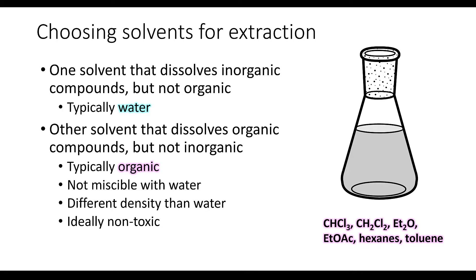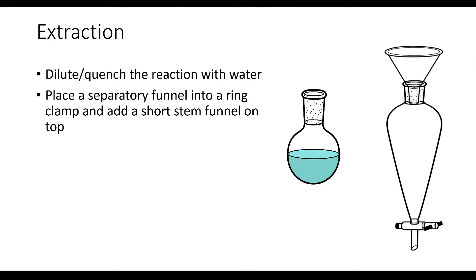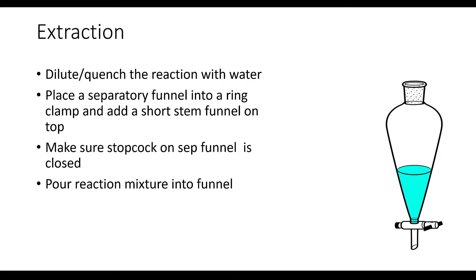Now let's talk about the details of the extraction procedure. We start by quenching or diluting the reaction mixture with water. Then we take a separatory funnel and place it into a ring clamp, and we use a short stem funnel to help transfer the liquid into it. Make sure that before you start pouring anything into the separatory funnel the stopcock is closed. Once you've confirmed the stopcock is closed, go ahead and pour your reaction mixture into the separatory funnel.